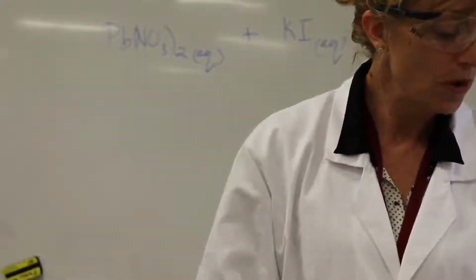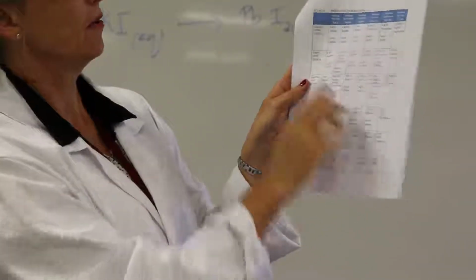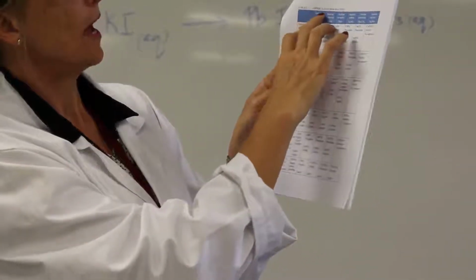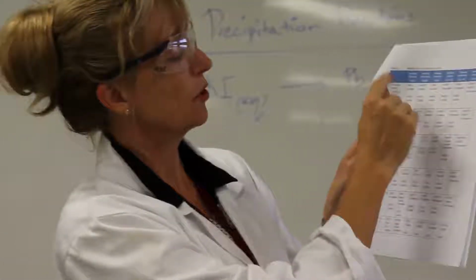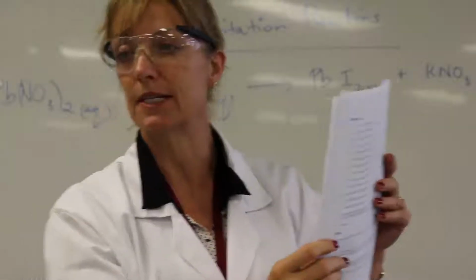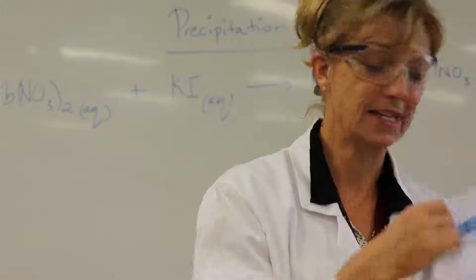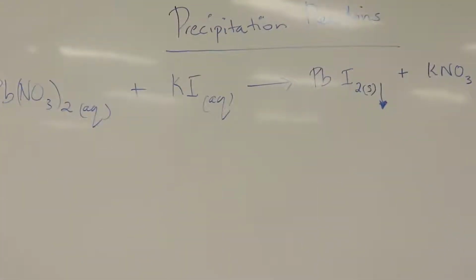So in your prac, unlike this one here, you've got a blank table and you're going to combine those two and then write what happens. And you're going to fill this whole table out with what happens. So when it's expanded out, yeah, that's right. You're going to fill this table out.